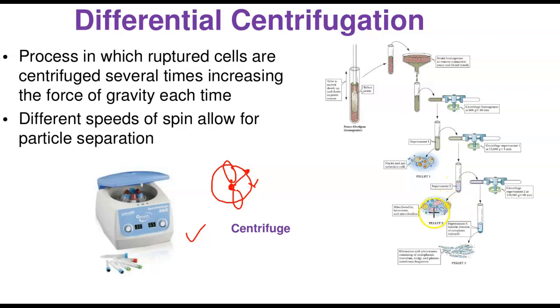The residue here now is the mitochondria, the lysosomes, and the microbodies is what you see. You get this supernatant, which is another clear layer, and spin it again for the third time. In this third time now, you increase the speed drastically. You are increasing the speed from 15,000 in this second step. Remember, this is 1. Now this is 2. In the third step, look at what you're increasing it to: 100,000 G, and you are spinning it for 60 minutes.